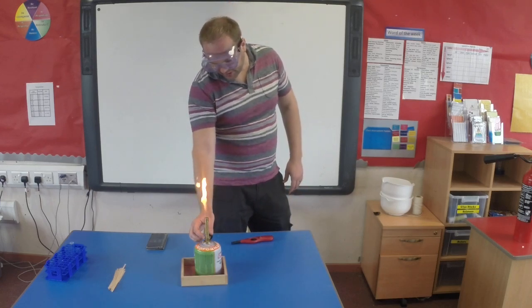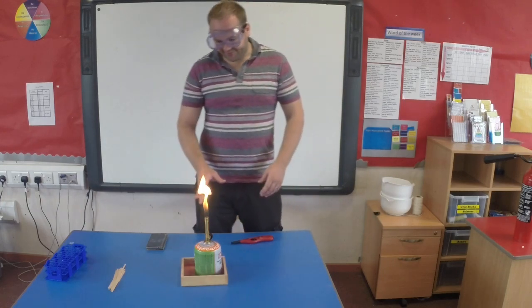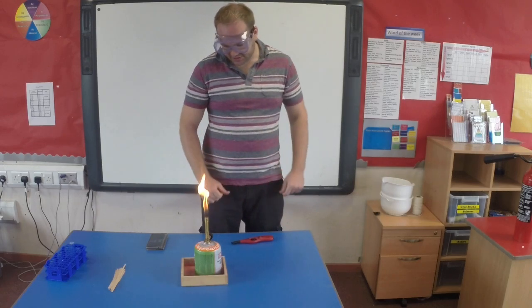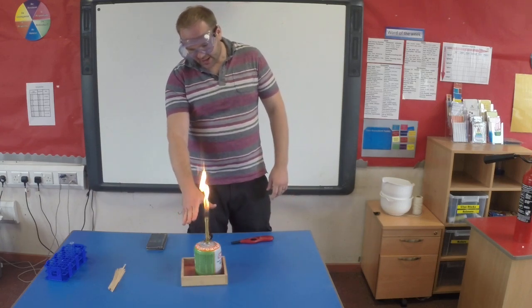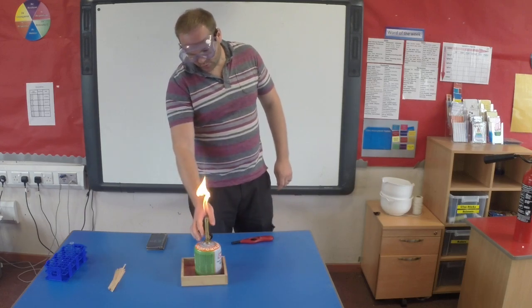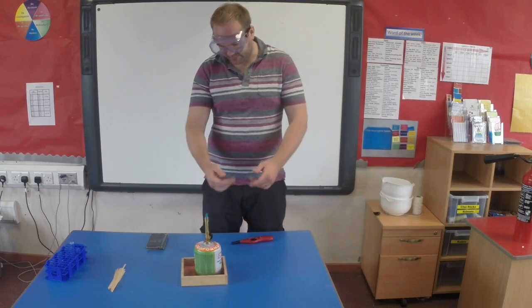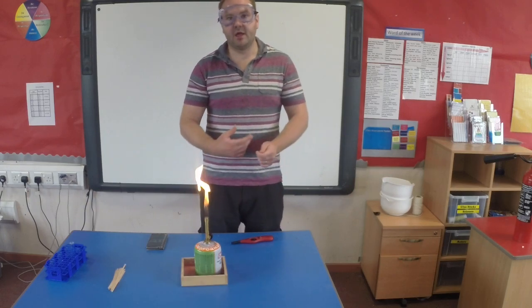Now there's loads of applications of this. A rule that we have is if we're needing to heat something up, we bring it to the heat source. We don't bring the heat source to it. So this stays flat and still, and anything that we need to heat up, we would make sure that we've got everything ready, turn it to our blue flame, heat it, and as soon as we're done, it would go back to the safety flame.